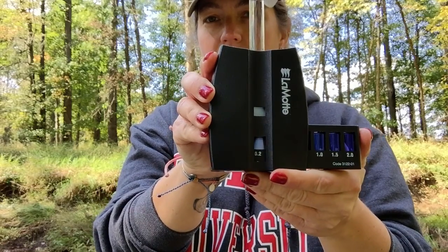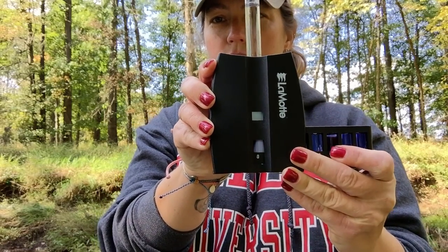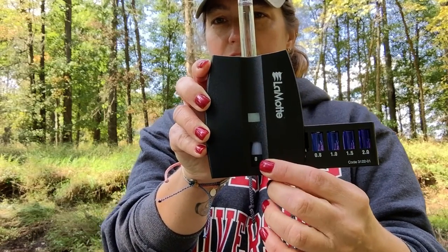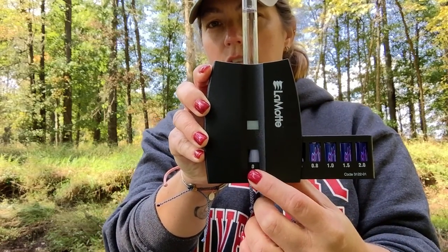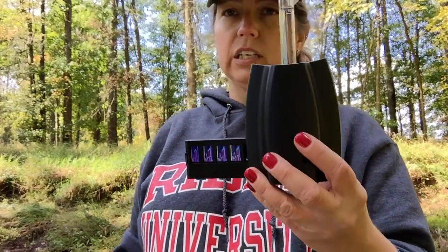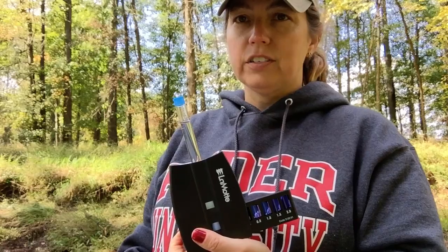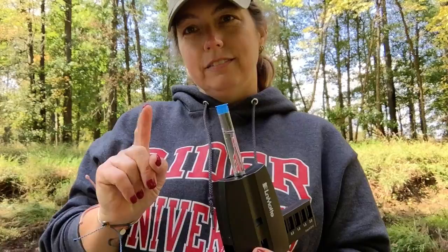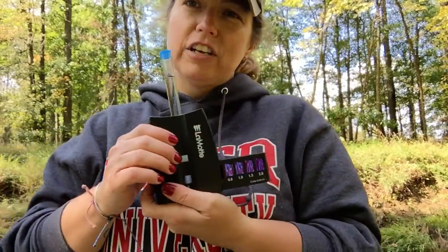The color between here and here is no different. So that means there's zero parts per million of phosphorus. And like my natural tendency right now is to tell you whether that makes sense or not, but you guys have to figure that out. So that's our phosphate test.